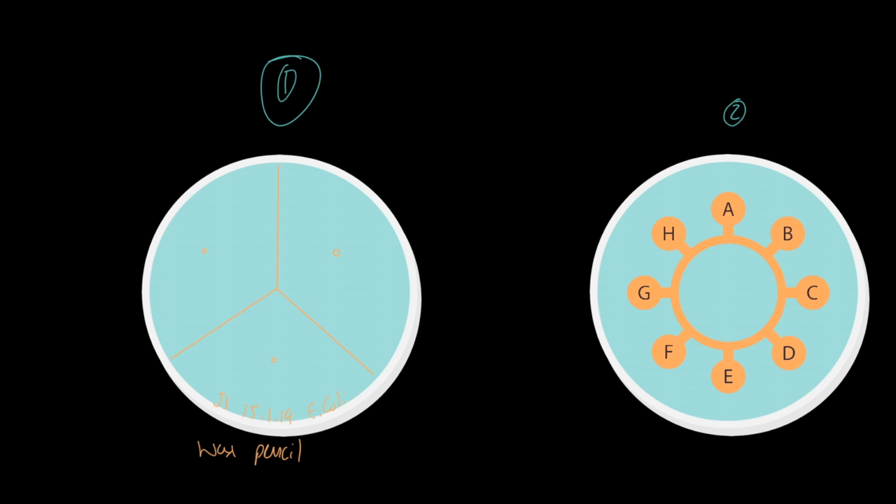Okay, now once we've done that, we're going to turn this over, and effectively what we are going to do is apply our antibiotic discs onto these spaces, onto these areas. So from above, although we wouldn't be able to see the lines because the agar would be in the way, we would have 3 antibiotic discs with 3 different antibiotics placed onto the surface of the bacterial lawn. So just be reminded that blue actually represents the bacterial lawn.